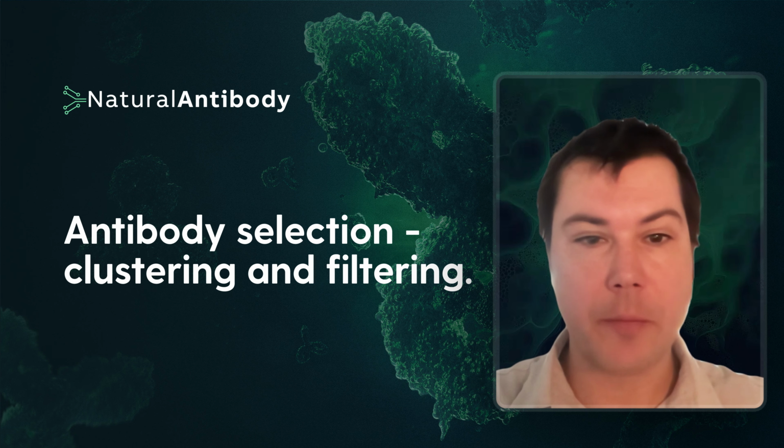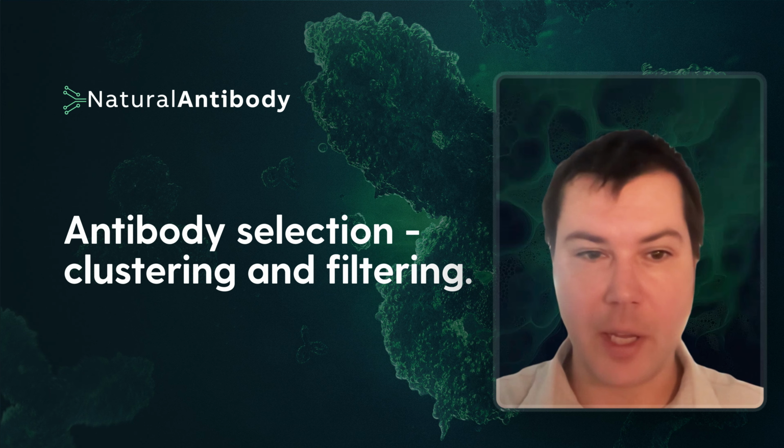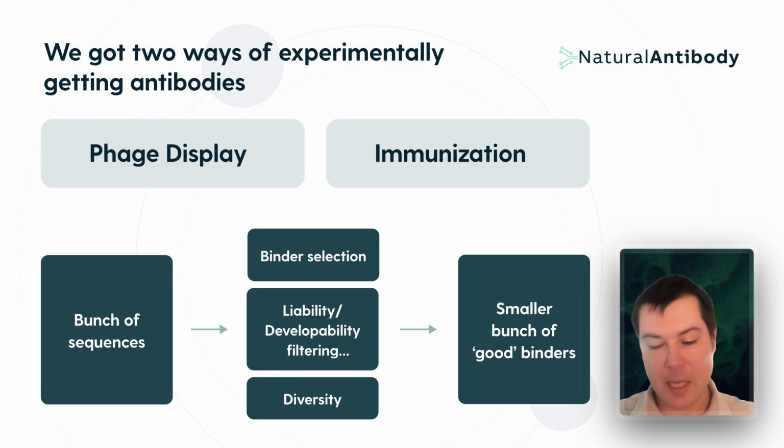So altogether, we have two major experimental ways of discovering antibodies these days. One is phage display, the other one is immunization. In both of those techniques, we can use NGS to get a bunch of sequences from which we have to select a set that are binders and that are devoid of any obvious computational liabilities.